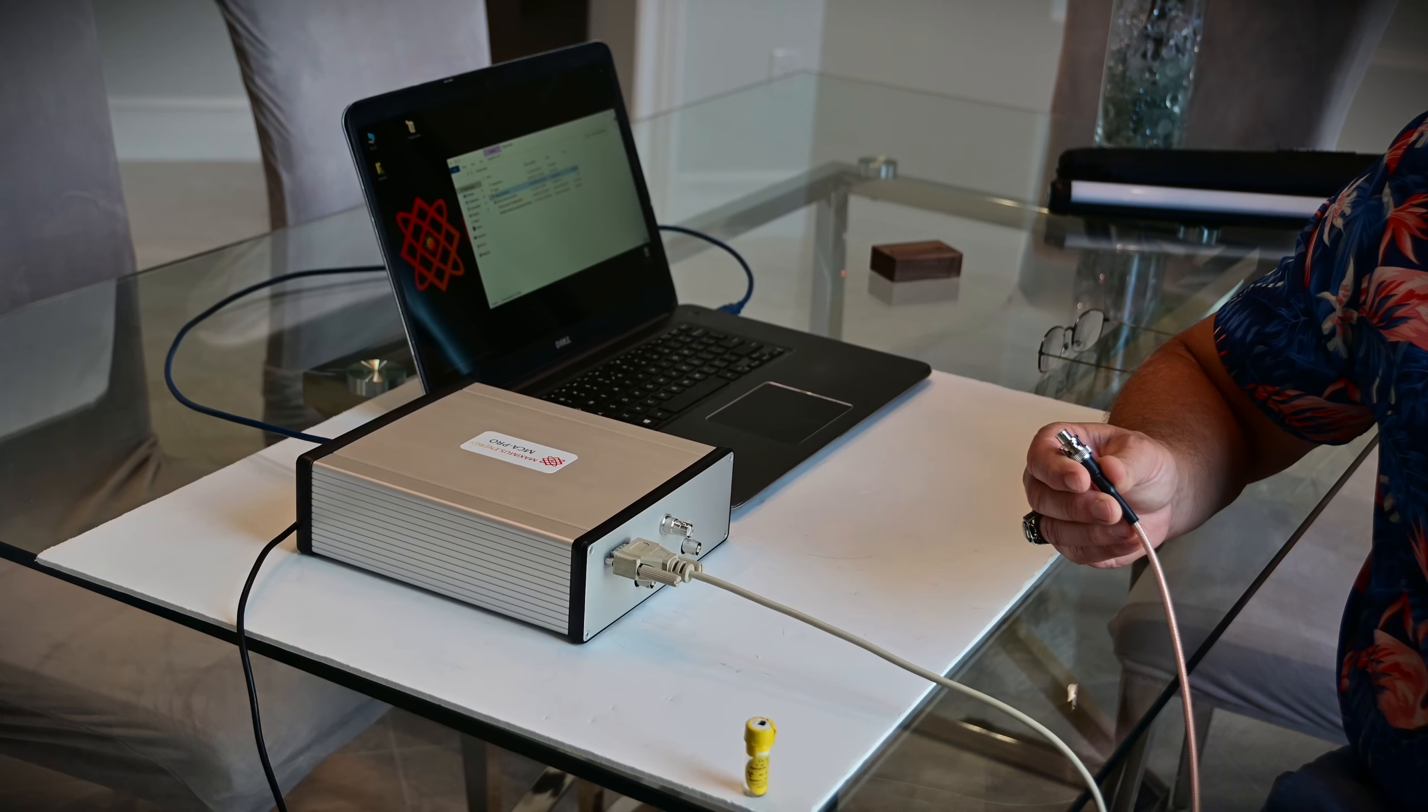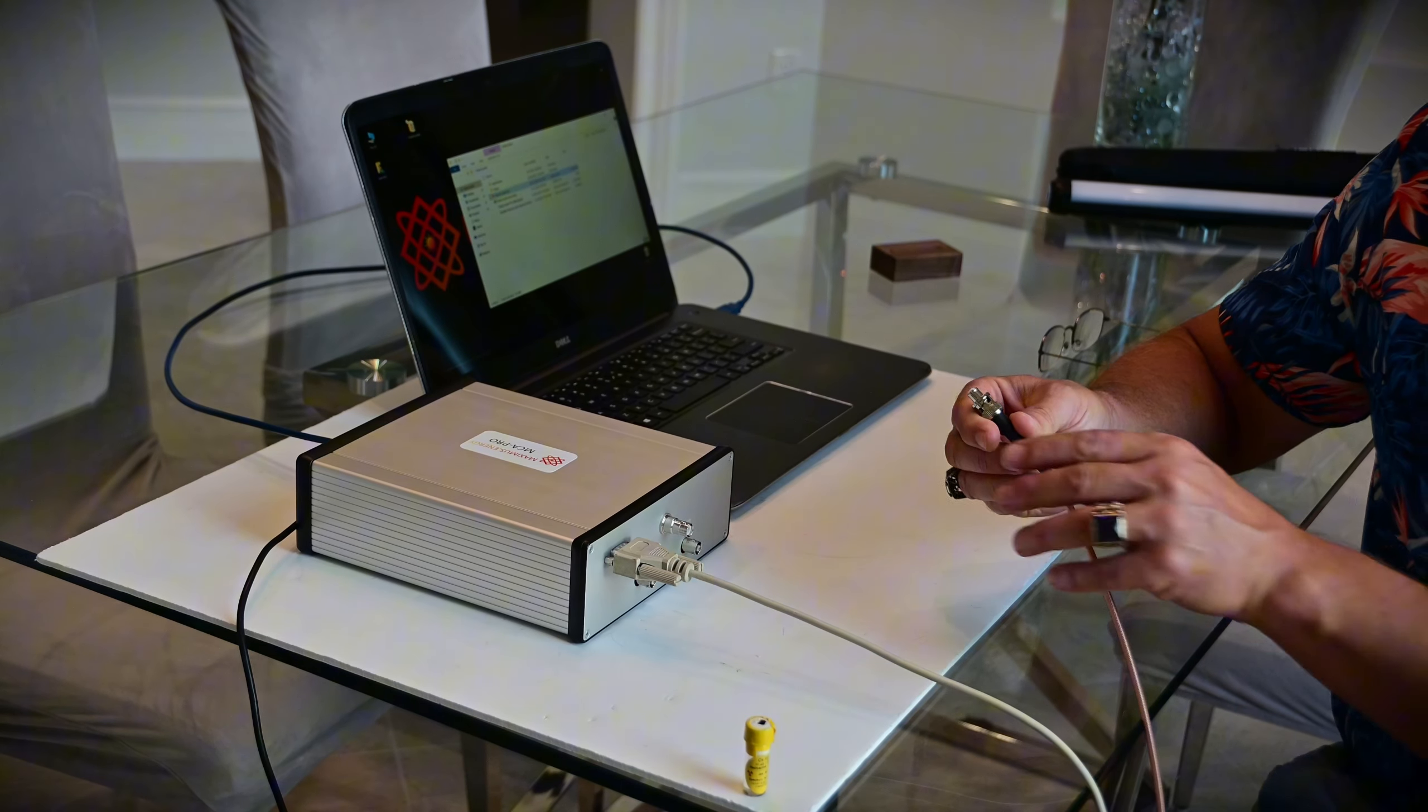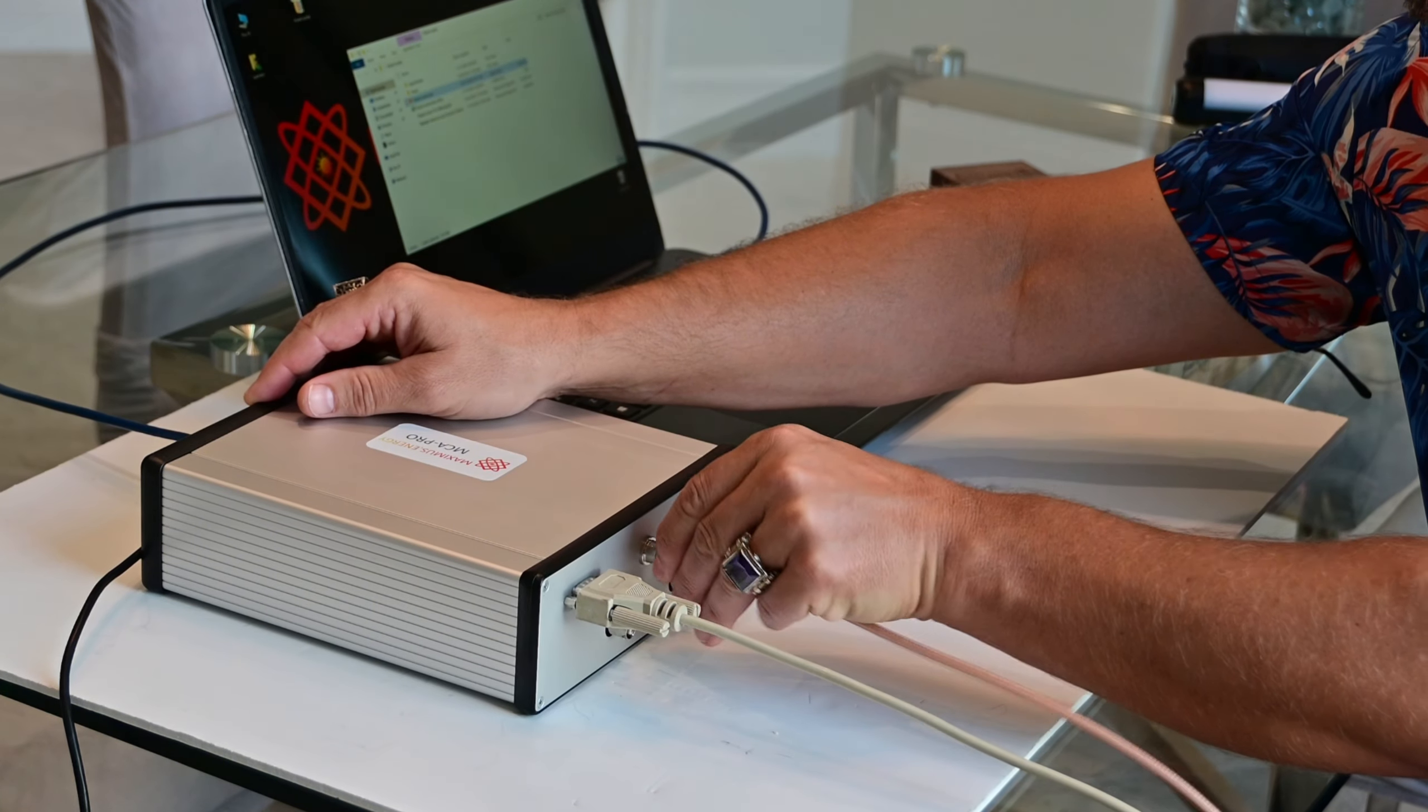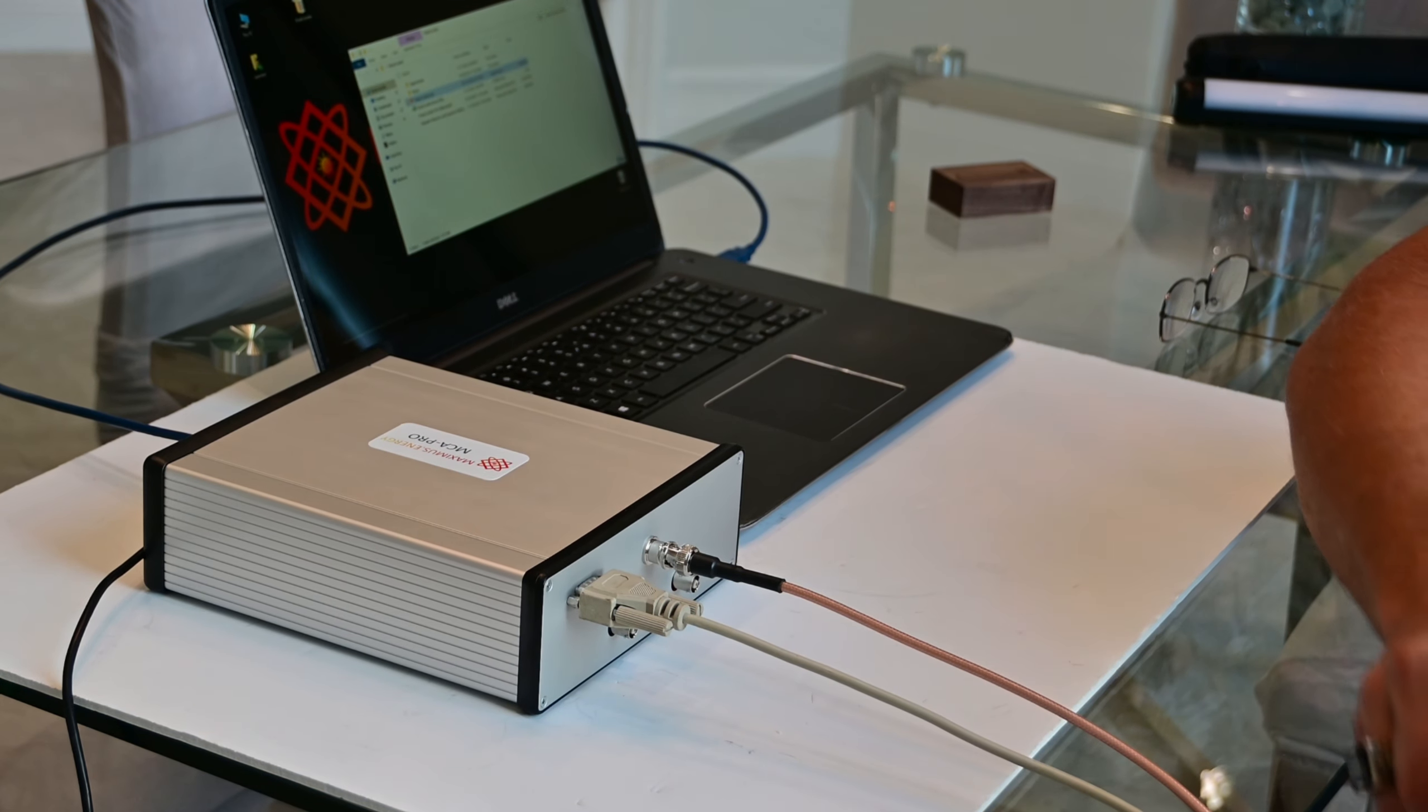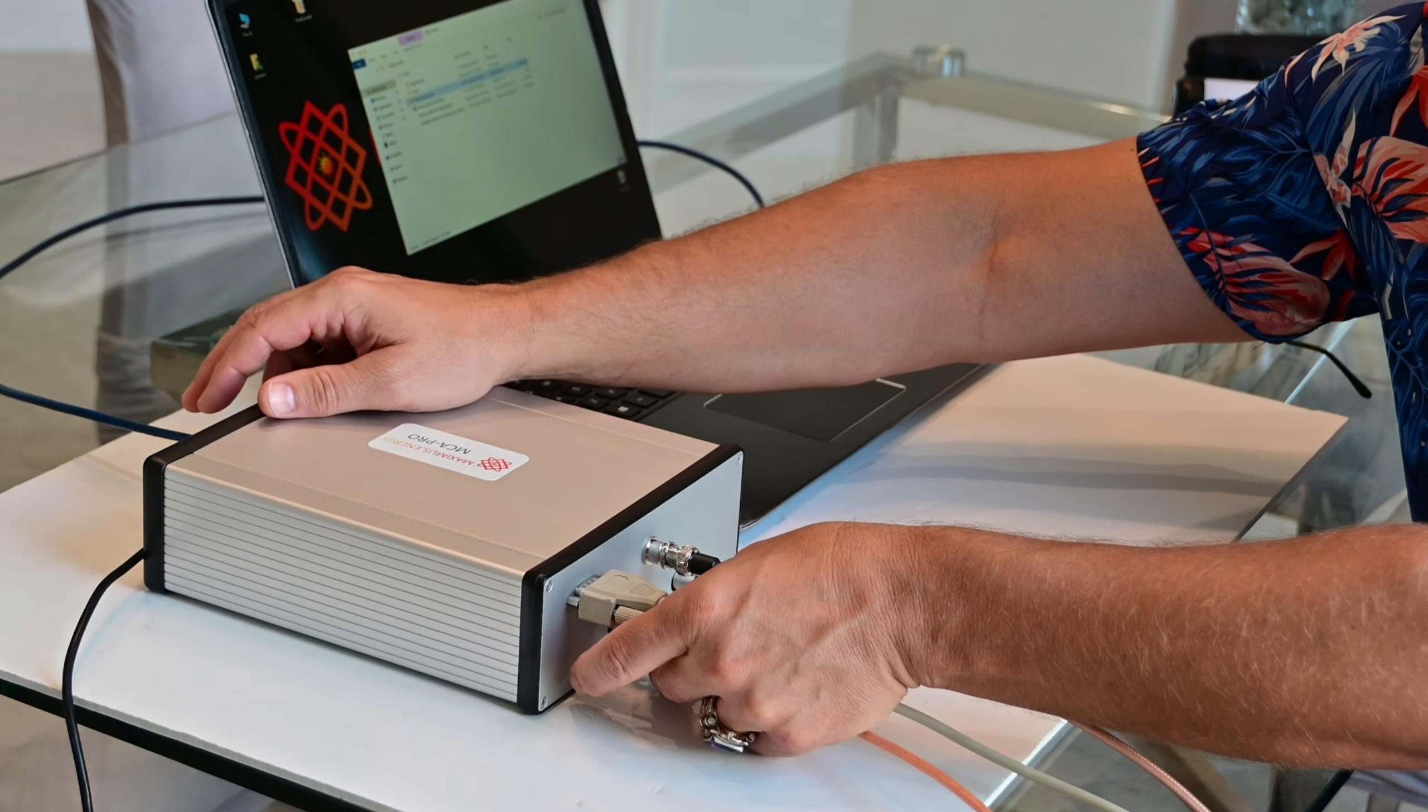Then you connect the SHV bias cable from your detector to the MCA Pro. Finally, you connect the energy output of your detector to channel 1 on MCA Pro.